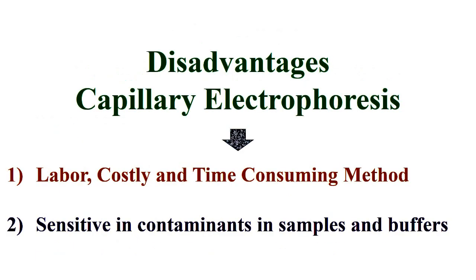On the other hand, capillary electrophoresis is considered a laborious, costly, and time-consuming method, and it is sensitive to contaminants in samples and buffers.